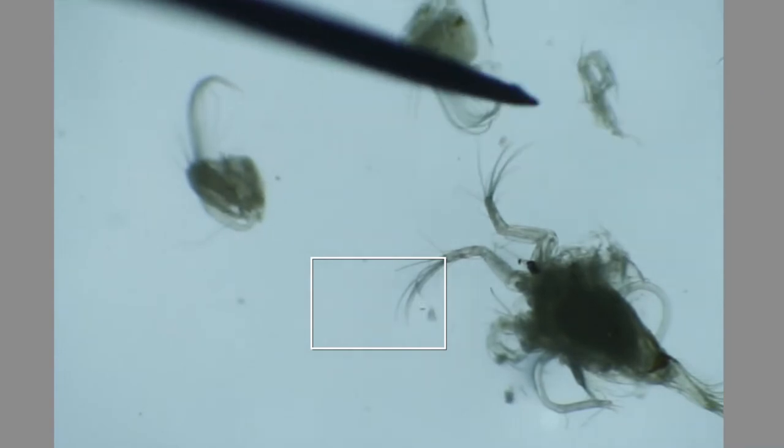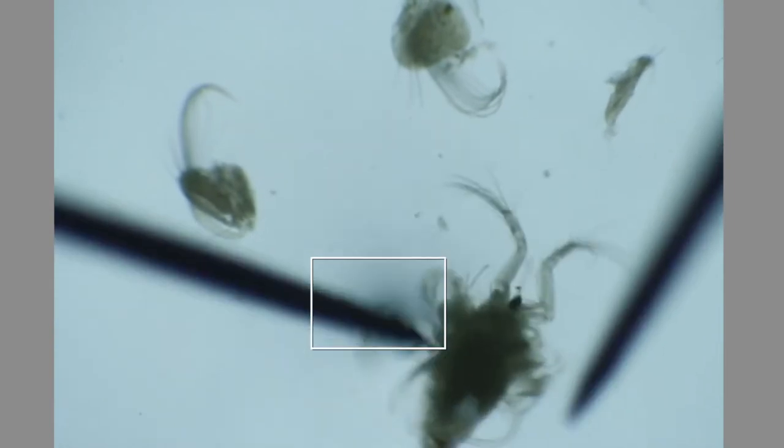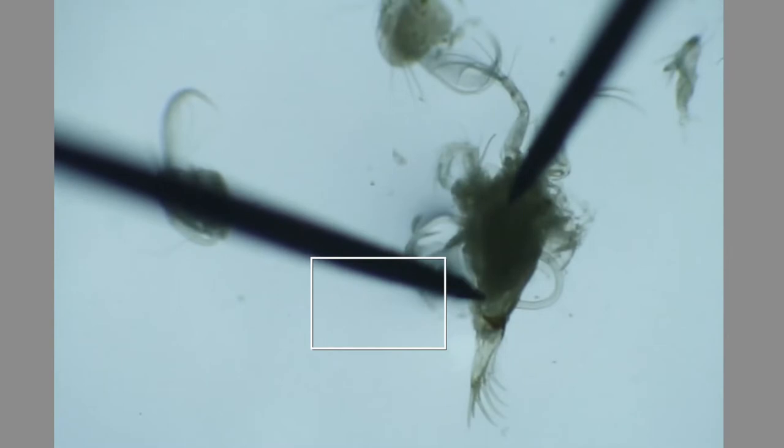I think it's a mandible — I can't quite tell from this far away, and I only get one eyepiece when I'm doing it on camera. Now I'm going to try taking off the furca.